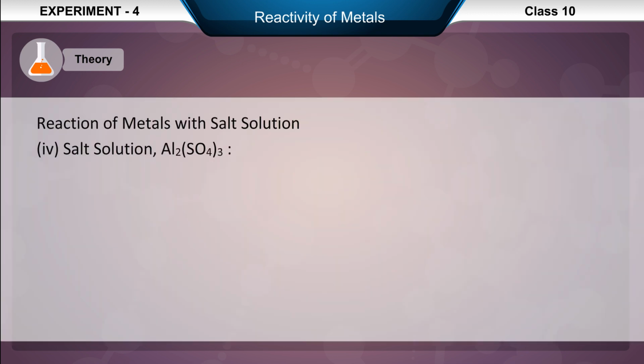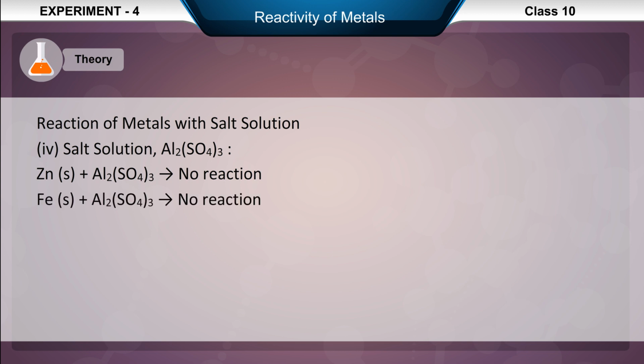4. Salt solution Al2(SO4)3. Zn in solid state plus Al2(SO4)3 results in no reaction. Fe in solid state plus Al2(SO4)3 results in no reaction.